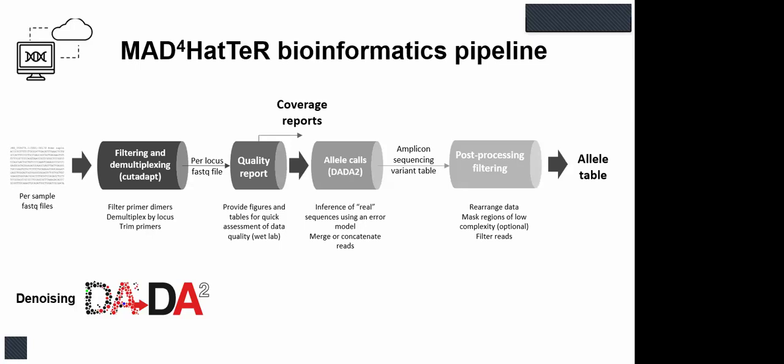The other thing to notice is that this pipeline is put together in the Nextflow language because we are using multiple tools. Others have not mentioned them, like FastQC and others, but we use multiple tools, for example, Tandem Repeats Finder for those tandem repeats, and there are so many other tools which look at the complex regions.